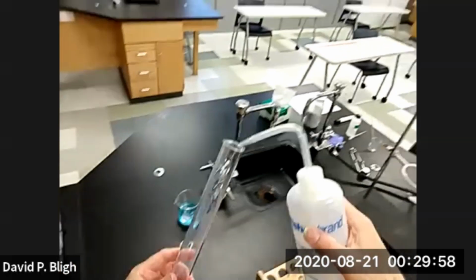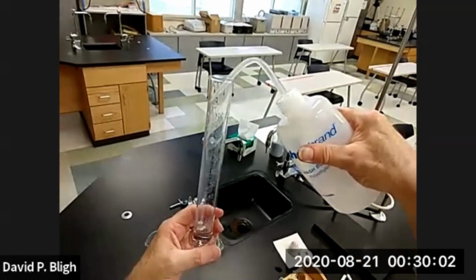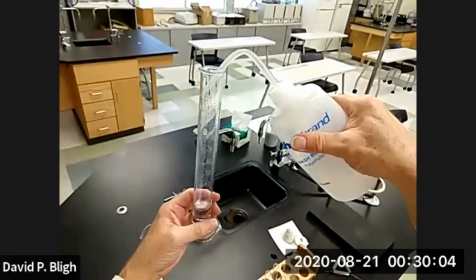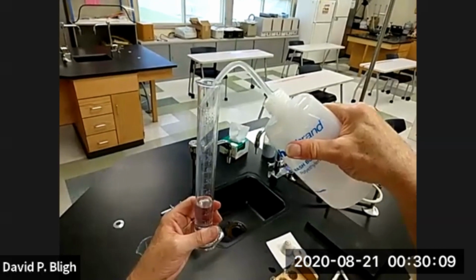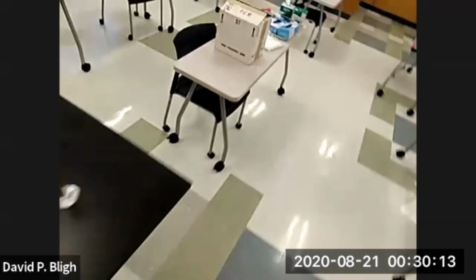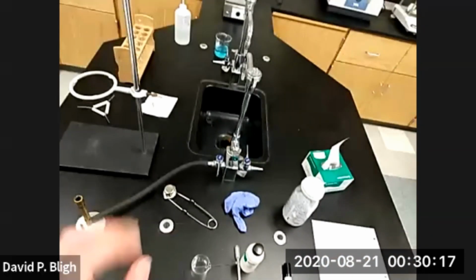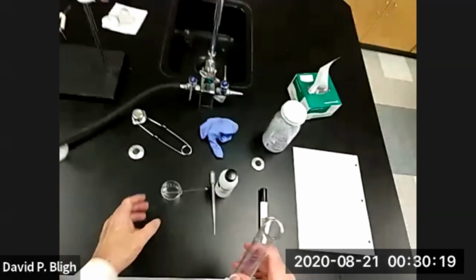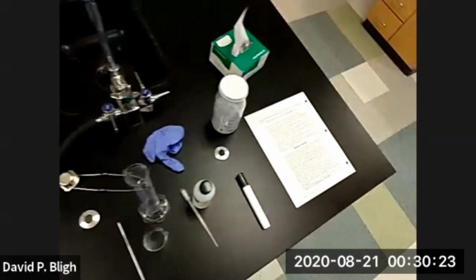And let's do it the hard way. There's 10. Coming up on 20. And almost to 30. Now this doesn't have to be exact, just in the neighborhood. This is a qualitative examination of the product of our last heating. Right. So let's keep that separate first.